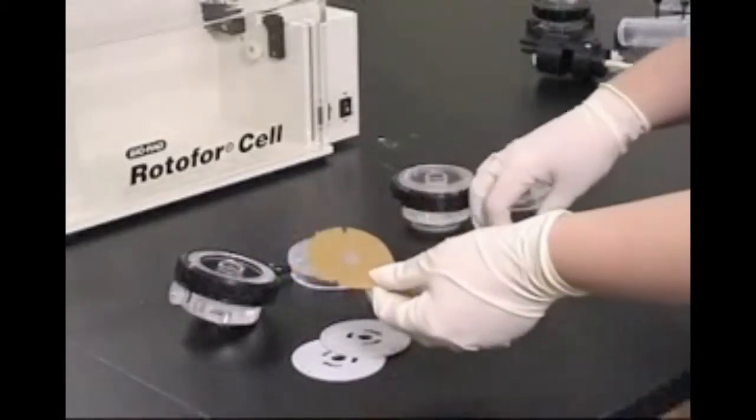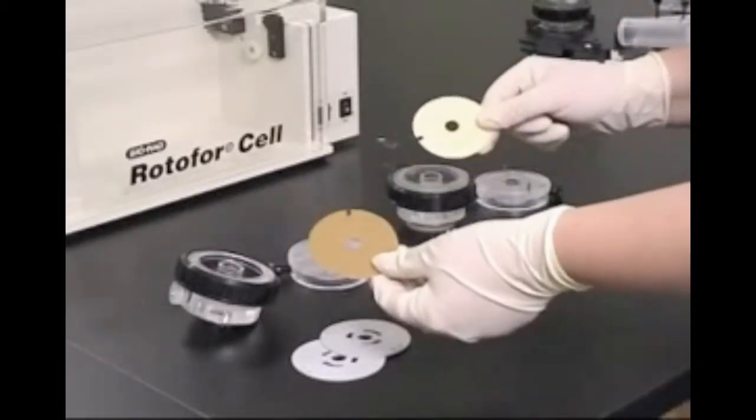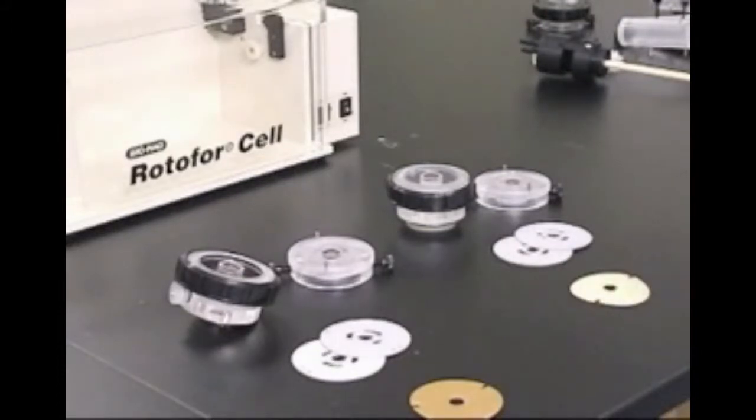There are two types of ion exchange membranes and they are not interchangeable. The anion exchange membrane will only fit in the cathode chamber, and the cation exchange membrane will only fit in the anode chamber. The colors of the two membranes are different when they are dry, but they are similar when they are fully hydrated.